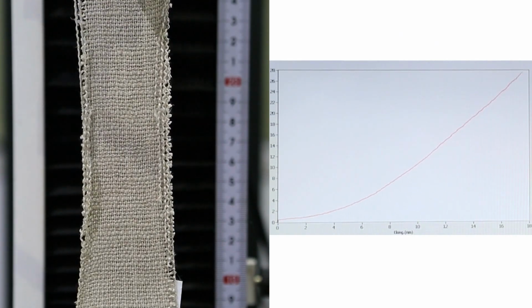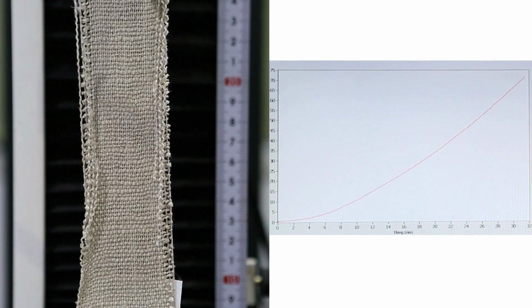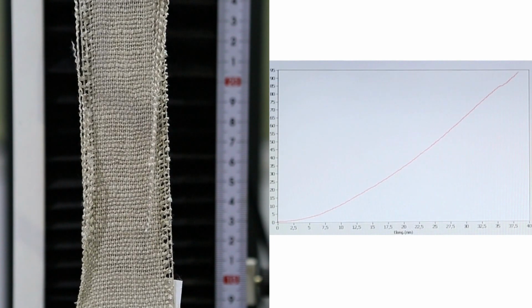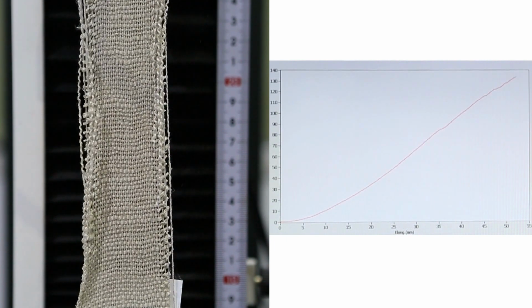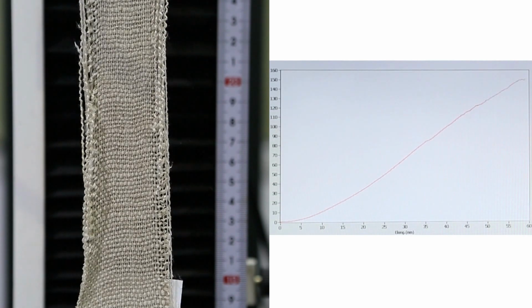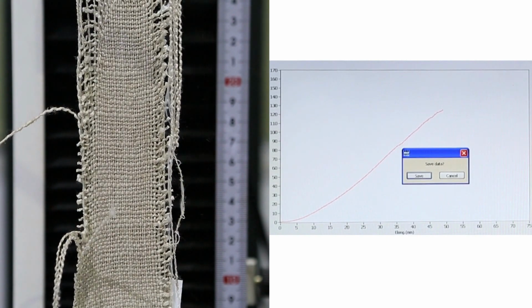All fabrics also have their tensile properties and slippage resistance at a seam measured on a dynamometer. An automated device connected to a computer program that quantifies the pulling strength applied, the elongation of the sample during the test, and the final opening of the seam.